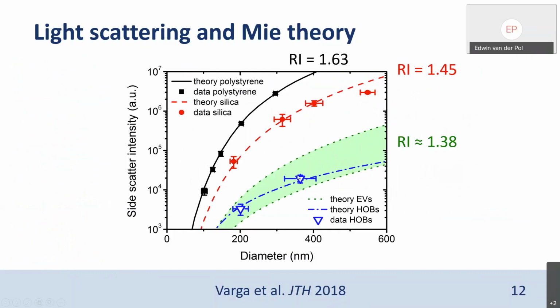They are hollow, meaning only the shell is of silica, and the core of these beads is filled with the medium. So that resembles how EVs scatter light, and we use them to show that our Mie theory calculations are also right for low refractive index particles like EVs.